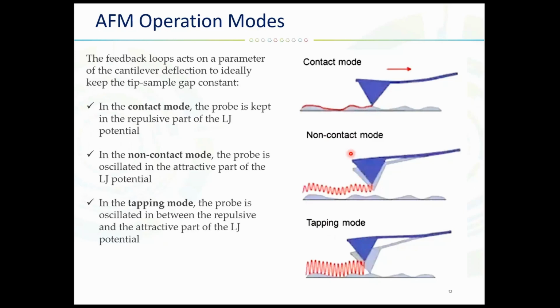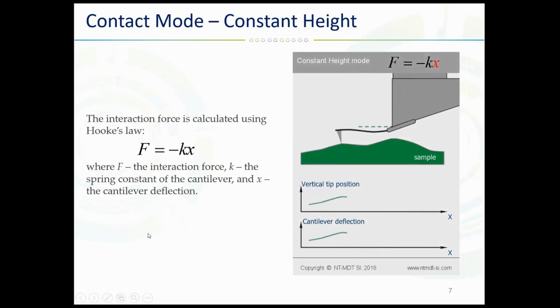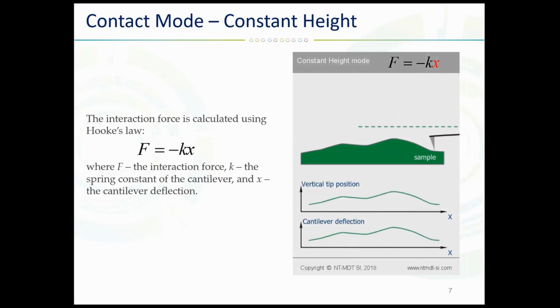Okay, so now let's go here. In contact mode, you have deflection of the cantilever, and it will reflect a repulsive force on the tip.